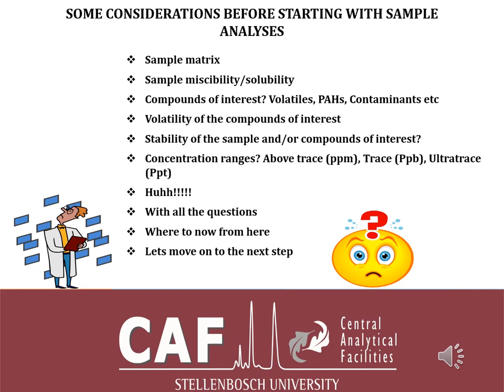As mentioned in my introduction, there are some important things that one needs to consider before analysis when it comes to sample prep. The sample matrix is very important. When we talk of sample matrix, we're asking what type of sample it is. Is it a solid sample? Is it a liquid sample? Or is it a gas phase sample? The reason that is important is that it determines which sample prep you will perform.